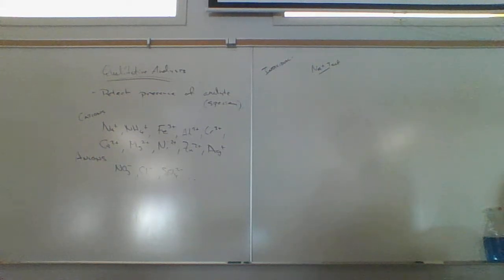Burn it off a little more. Still not clean. Still not clean.